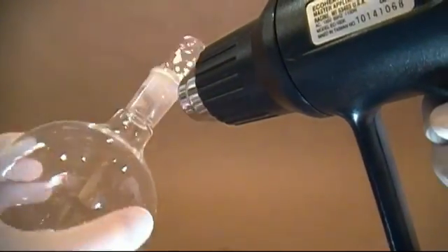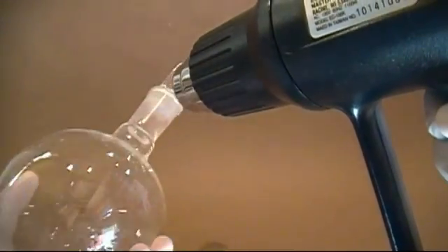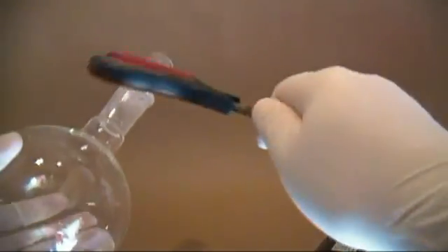Then grab something light you can strike it with without breaking the glass. I use the handle on a pair of scissors to do this. Begin to lightly tap the joint from all sides. The stuck object will usually fall out after a few seconds of tapping. Be sure you do this over a table so when it falls out it's not broken.